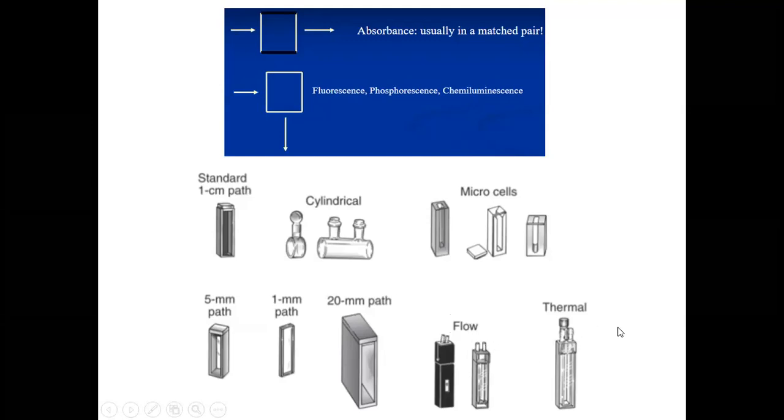For some thermal measurements, we have to conduct temperature sensitive measurements. So in that case, we can use this type of thermal cells. And these are some examples of the sample container that we can use.